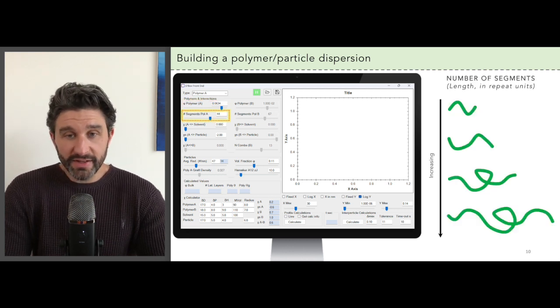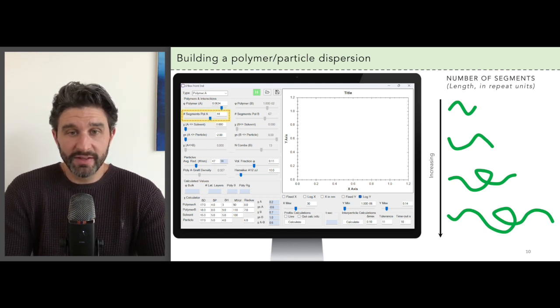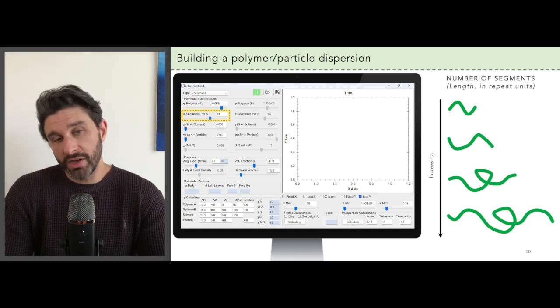The next parameter is the number of segments in the polymer. This is just the size of your chains. You have a rather broad range you can work with from quite short oligomers up to very long polymers.